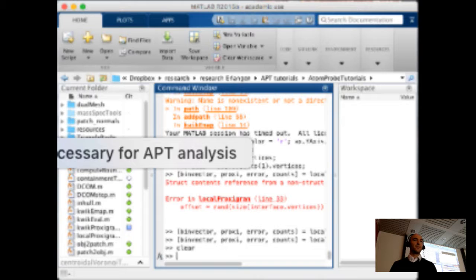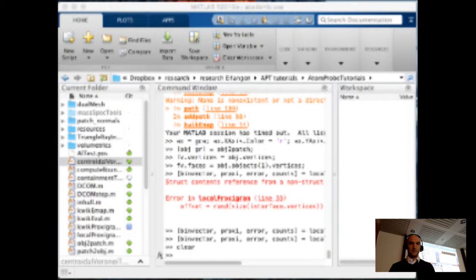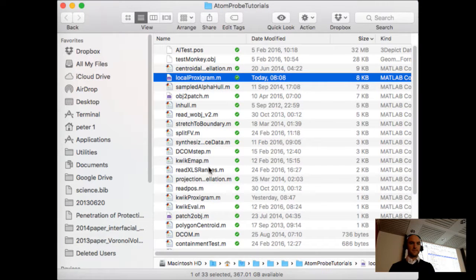No, that wasn't on GitHub. We're not going to put that up on GitHub. It's ongoing research. We can't put that up on the web for people. So if not, I think Jan has it on his laptop, and he can just pass it on. We'll need the POS file and the range file, the RNG file. I think she sent me an RNG as well. I can pass it on to you guys as well if you want to. I haven't written a function to load it into Matlab from the RRNG file, just from the RNG file.